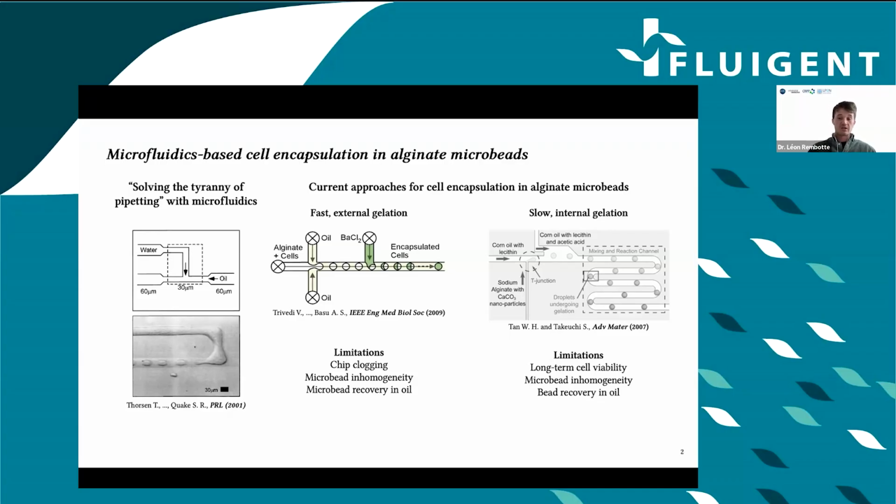Both these techniques, in addition, have the problem that once we form the microbead in oil, it can be tricky to recover the microbeads from oil, and you need to do several steps of medium exchange to recover the microbeads and go on with downstream processing.